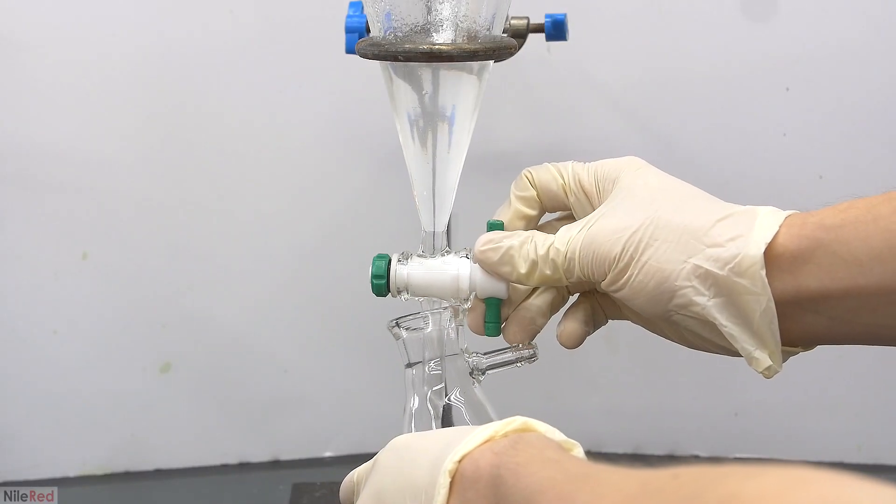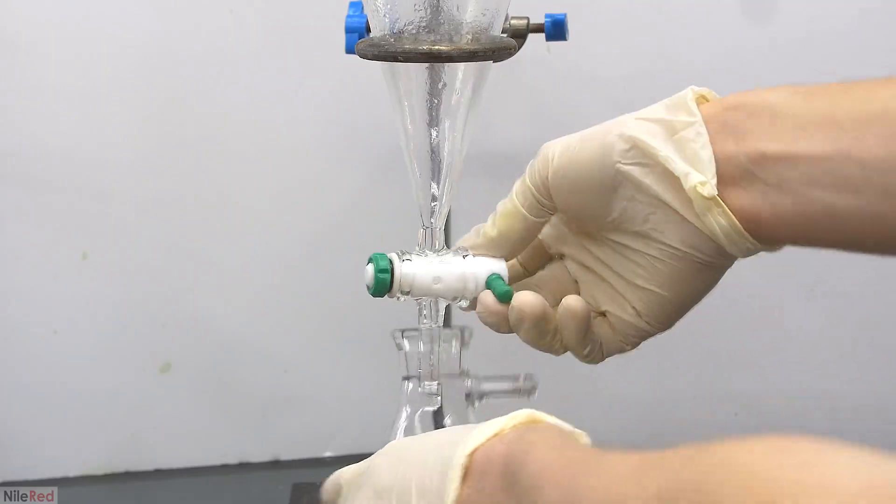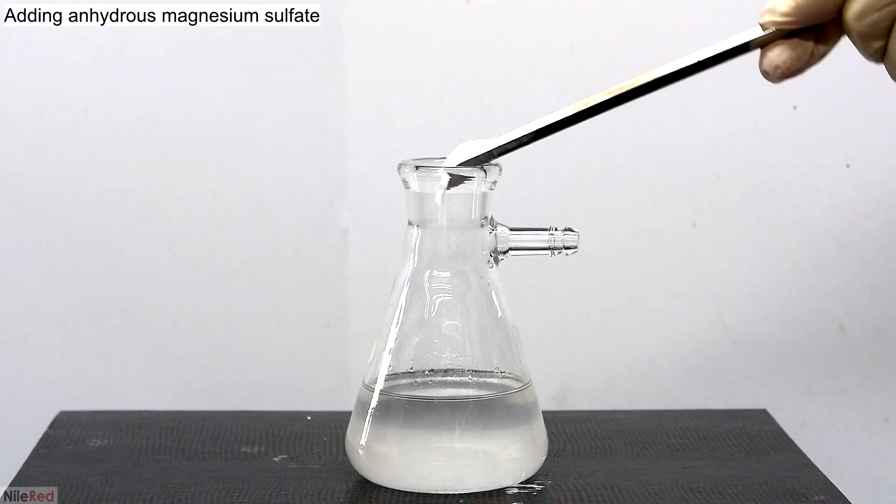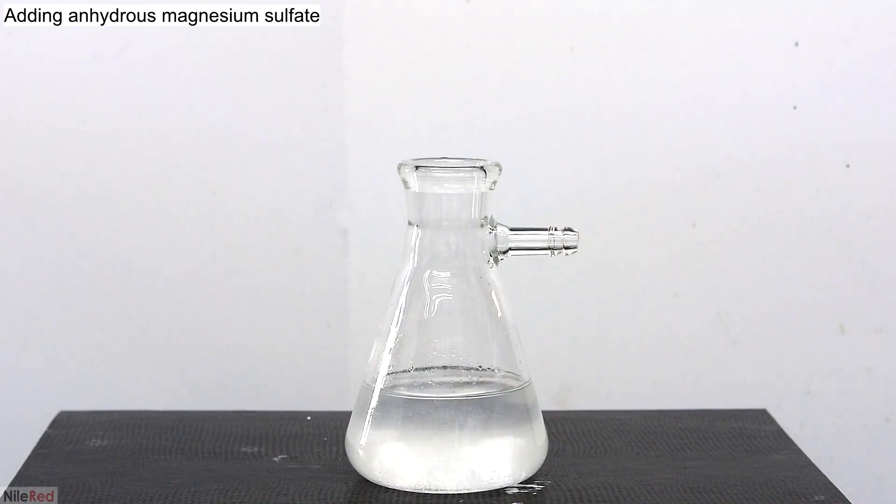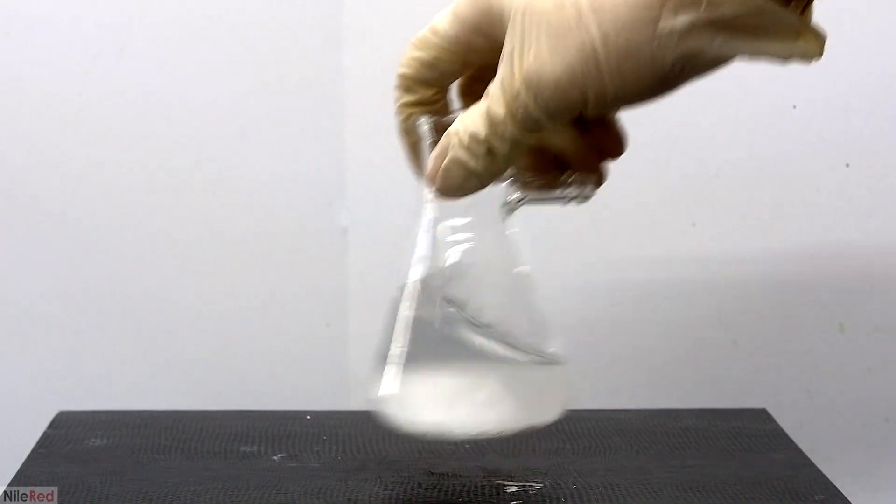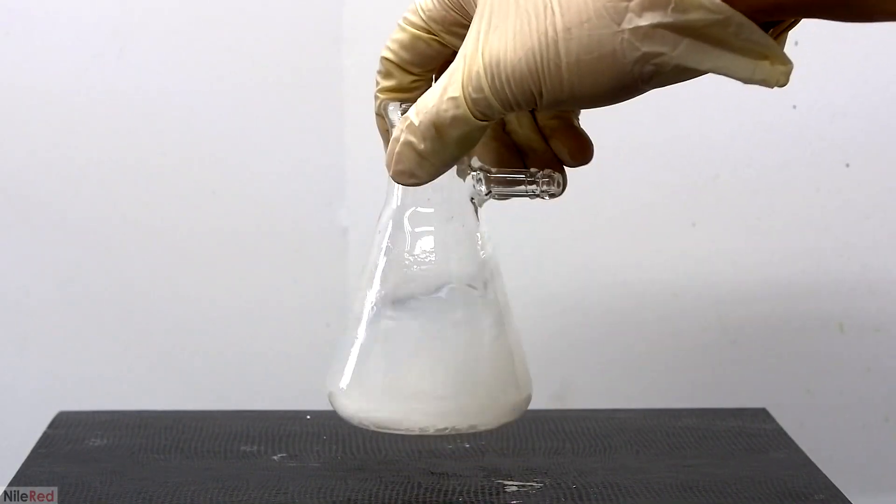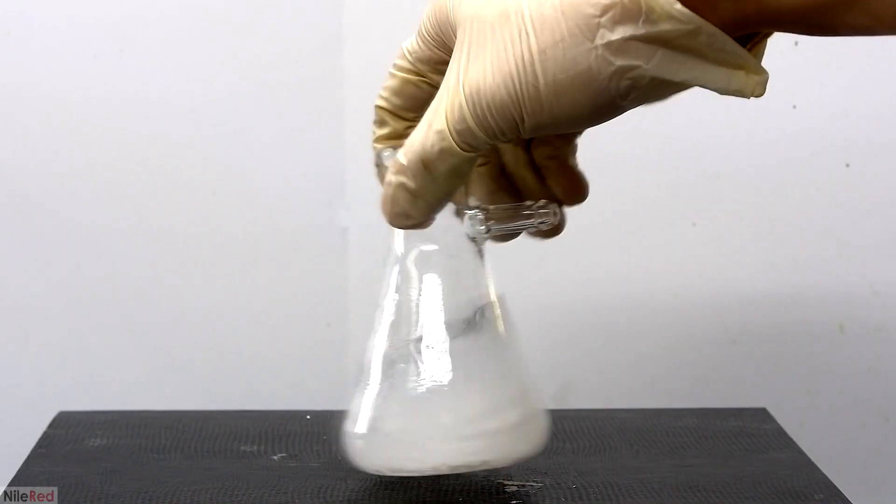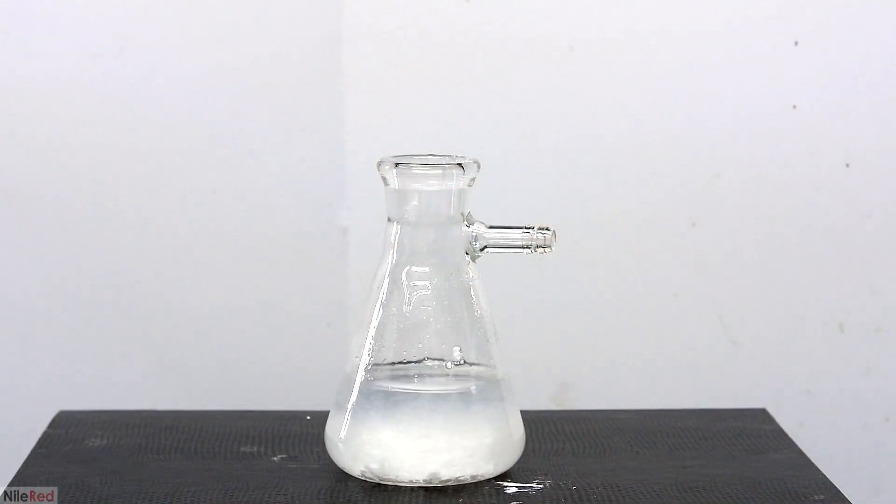The upper benzaldehyde layer is drained into a small Erlenmeyer flask. The benzaldehyde is a little bit cloudy due to the presence of water, so to dry things up, I add some anhydrous magnesium sulfate. The magnesium sulfate will form a complex with the water, and by doing so, it will dry the benzaldehyde.